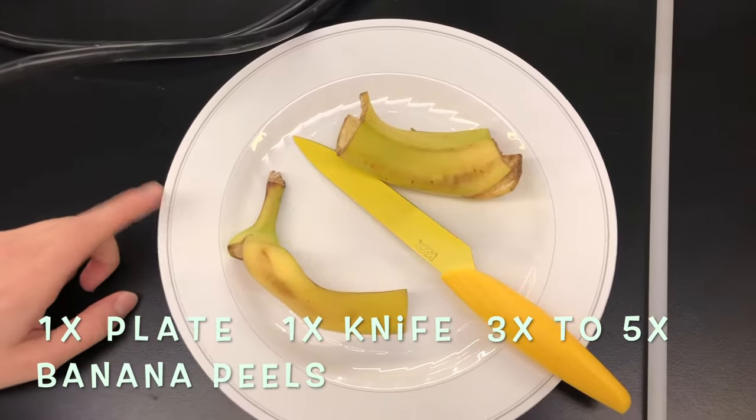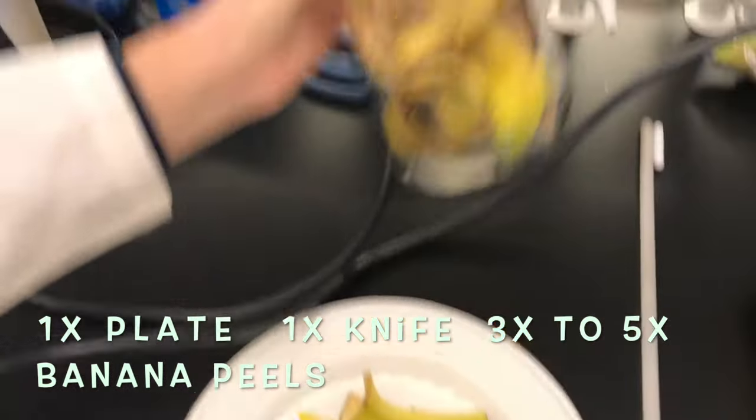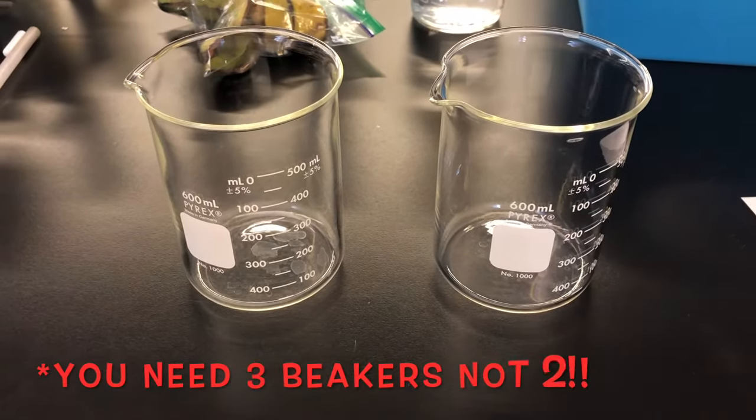For the lab you will need a plate and a knife to cut your banana peels, as well as about three to five banana peels. You will also need two beakers of 500 milliliters.